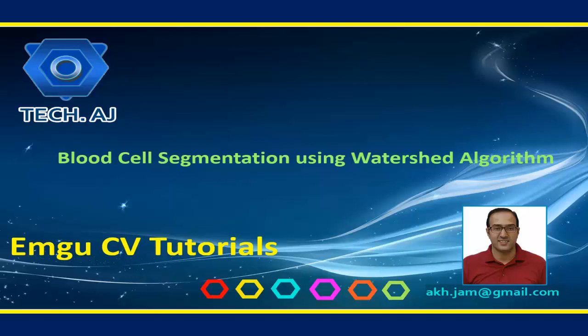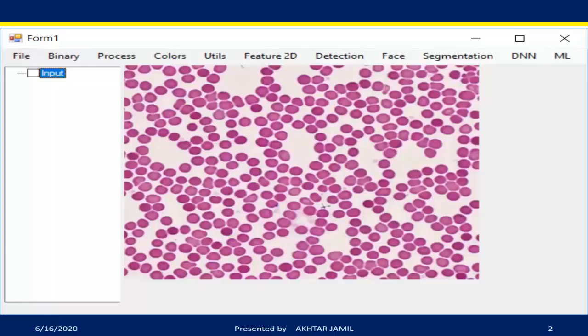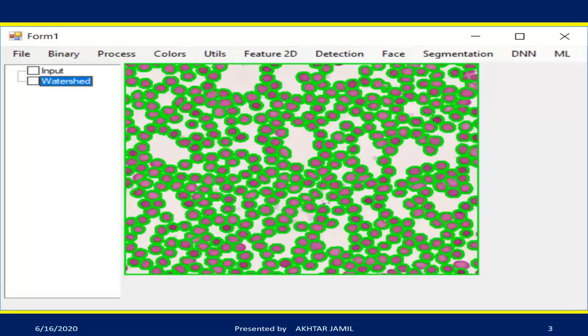Hello and welcome to this new tutorial. In this tutorial I am going to show you how we can apply the watershed algorithm for blood cell segmentation. This is what I want to achieve: I will read an input image of blood cells and segment each blood cell using the watershed algorithm.